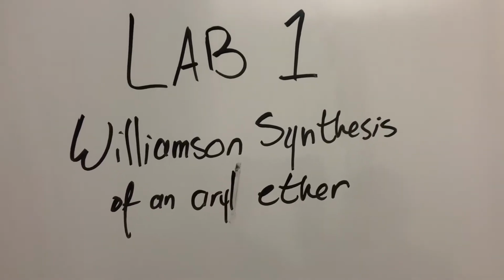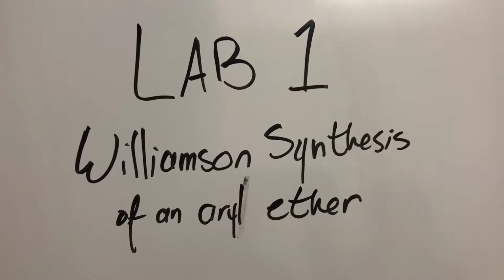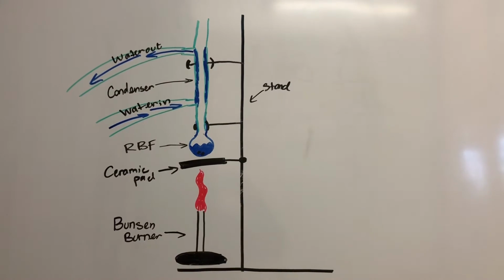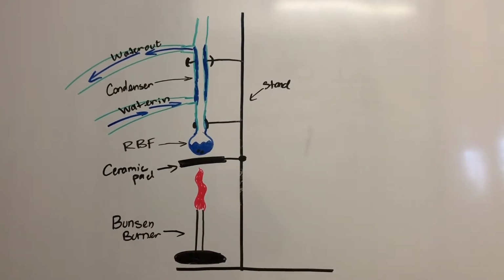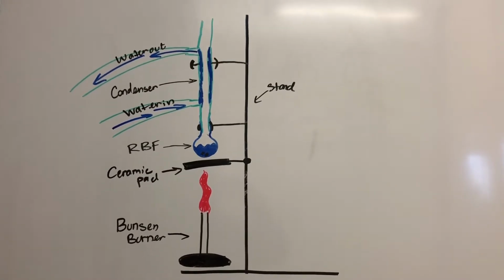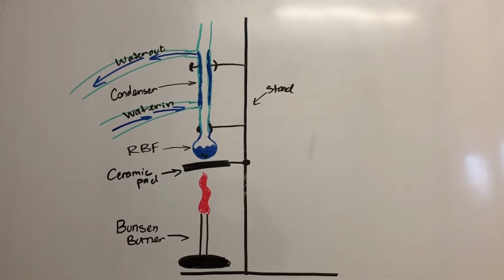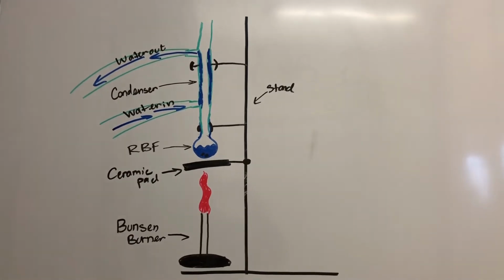In this video, we will be talking about the Williamson synthesis of an aryl ether. The goal of this lab is pursuing an acid-base reaction followed by an SN2 reaction to create an aryl ether. Our first step consists of refluxing the mixture of reagents, specifically the phenol, sodium hydroxide, and ethanol.